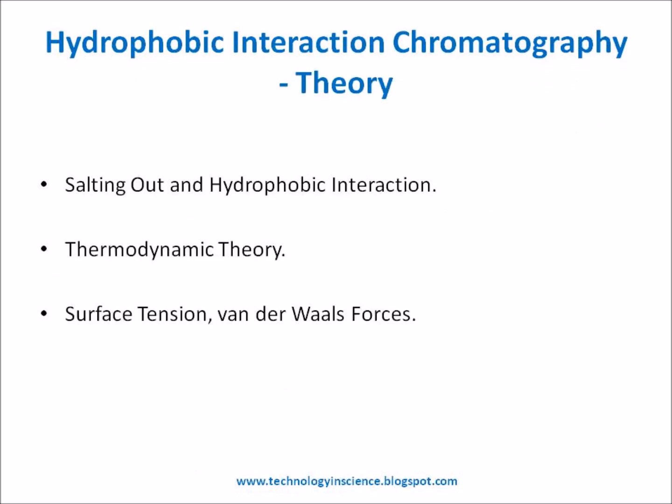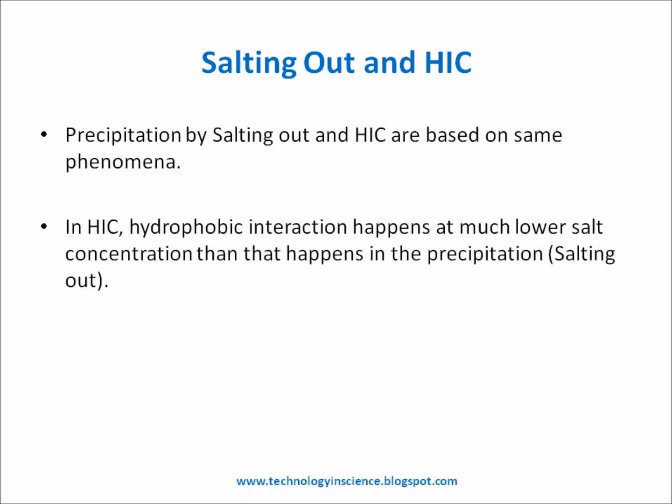Hydrophobic interaction chromatography theory. There are three major theories explaining the mechanism of hydrophobic interaction chromatography. They are the salting out and hydrophobic interaction theory, the thermodynamic theory, and the surface tension, van der Waals forces theory. Salting out and hydrophobic interaction theory.